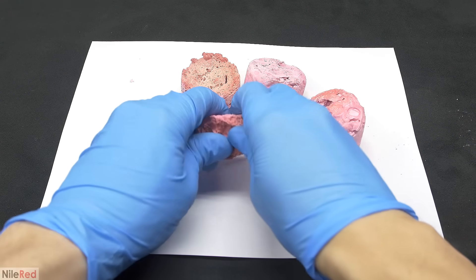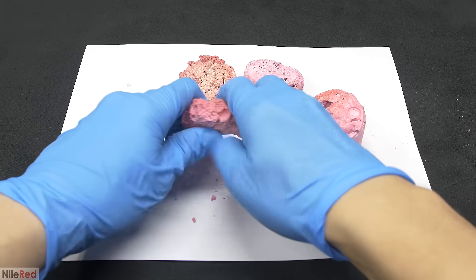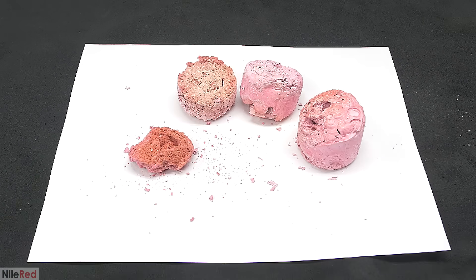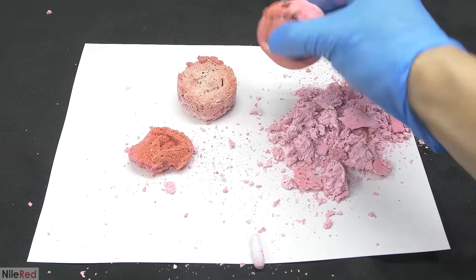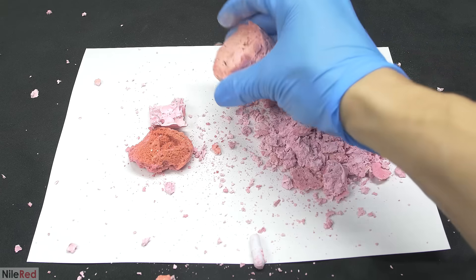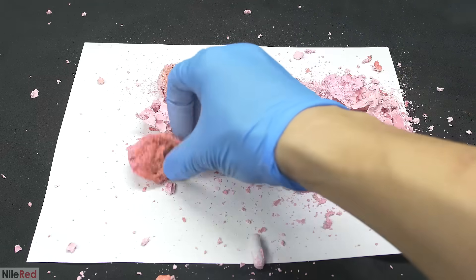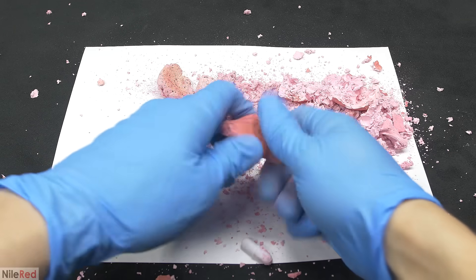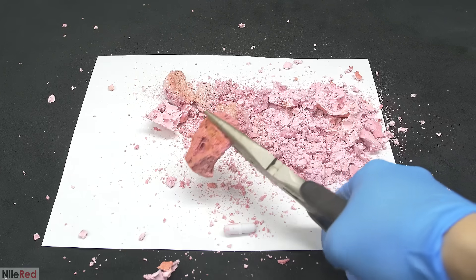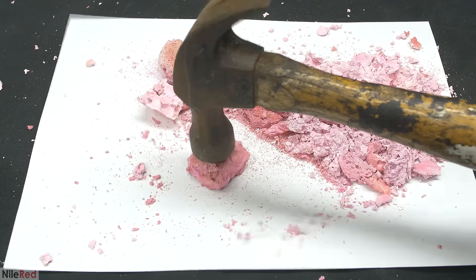They were transferred to a piece of paper, and I tested their properties, basically by trying to break them. The first one was the most dense, and it was made when I added the hydrochloric acid slowly. It was actually quite tough, and using just my hands, I wasn't able to break it. The more puffed up ones were very brittle and very easy to crush with my hand. Coming back to the denser one, it was actually pretty tough and I needed pliers to break it. Just for fun, I decided to hit the piece with a hammer, and again, it was surprisingly strong.